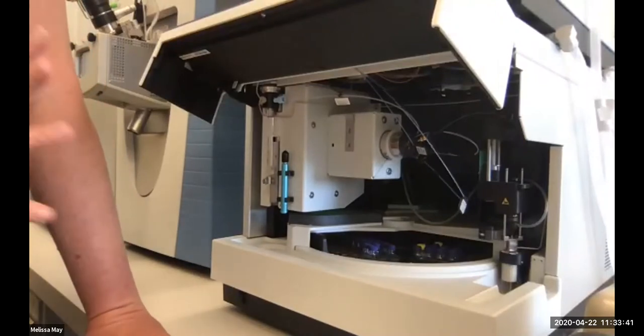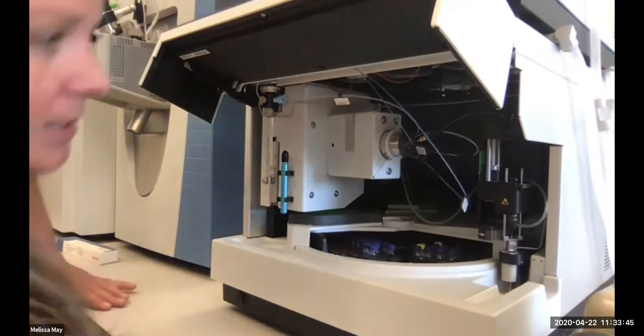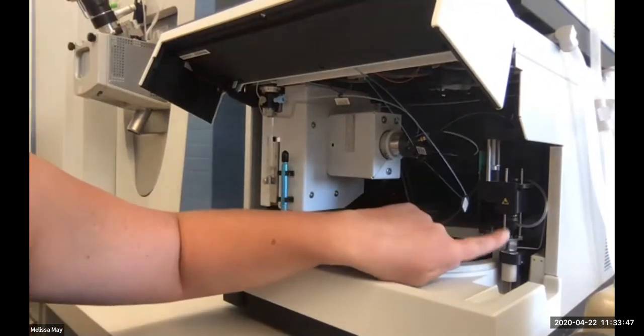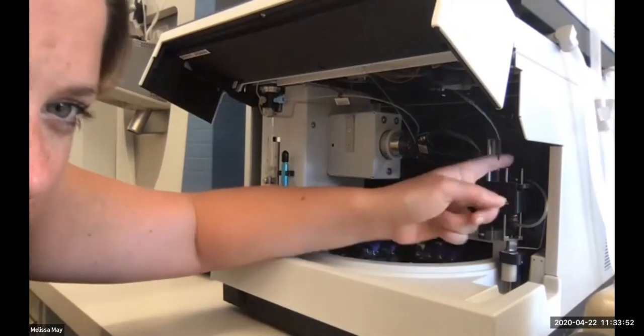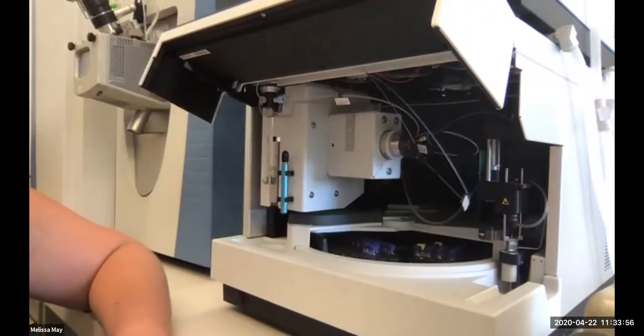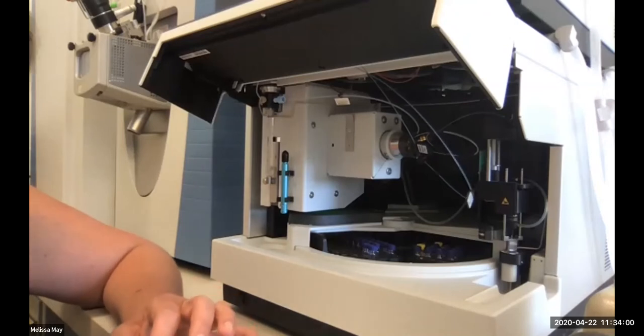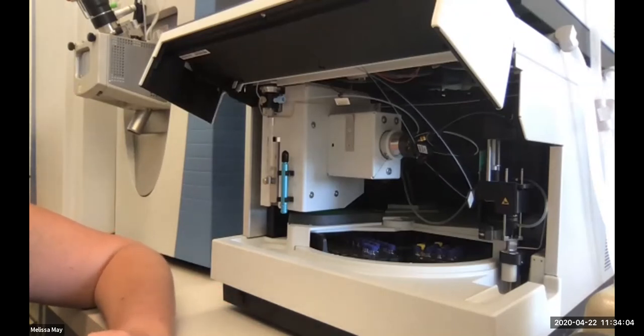In terms of our auto sampler, we have multiple different components down here. This right here is where our actual needle is. You can't see it right now, but maybe you can see right here. It's a very, very, very thin tube. I'm trying to see if I have anything that's equivalent in size to it.